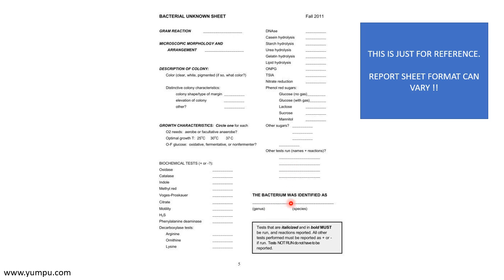Then you can write that according to Bergey's Manual of Determinative Bacteriology, my culture may belong to genus this and species this.